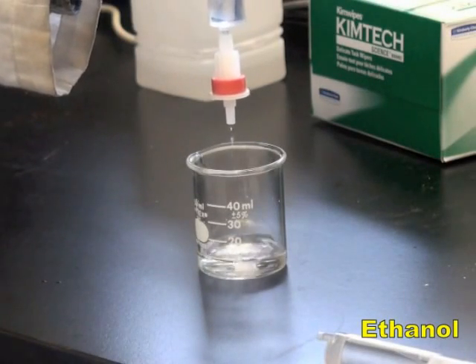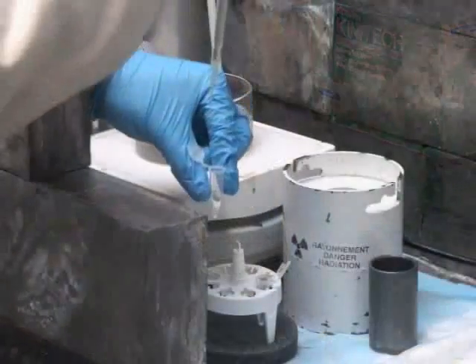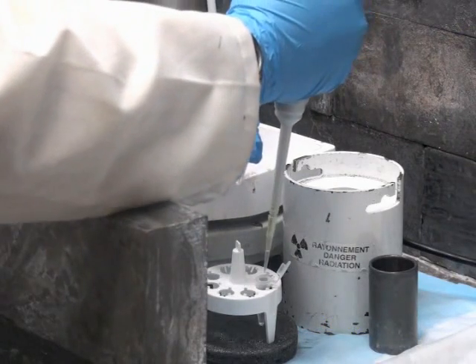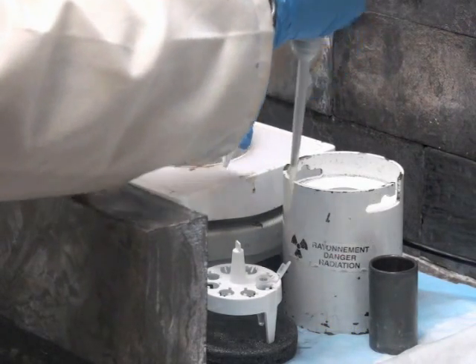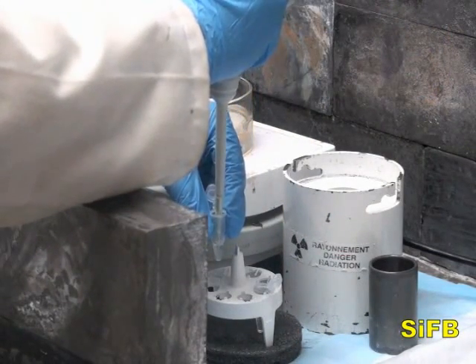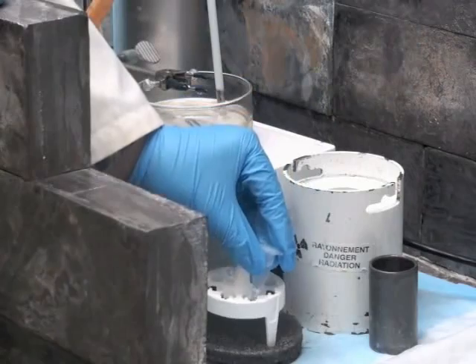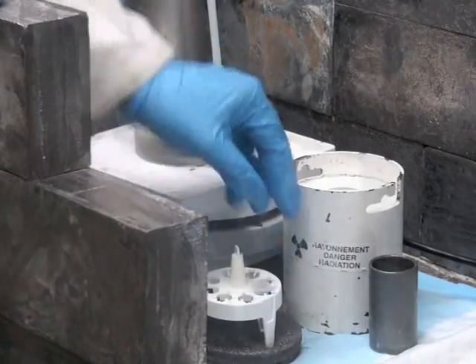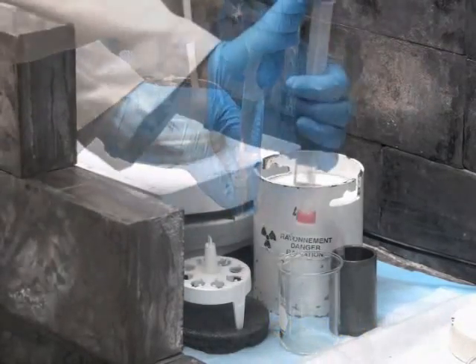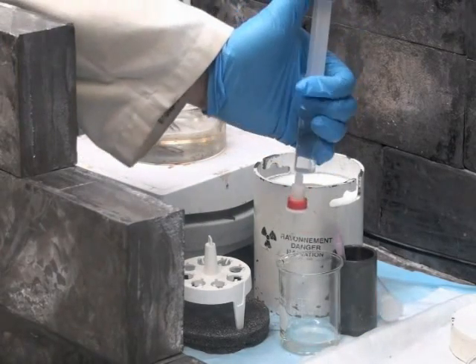Begin by pre-conditioning a C18 Sep-Pak light cartridge with ethanol, then distilled water. Add a solution of 0.1 molar oxalic acid in anhydrous acetonitrile to the solution of fluoride-18 anions. Next, add a solution of SIFB in anhydrous acetonitrile to this solution. Keep the reaction mixture at room temperature for 5 minutes. Dilute the mixture with distilled water, then pass it through the pre-conditioned C18 cartridge and wash the cartridge with water.